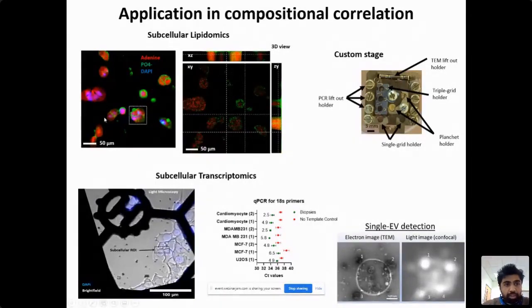So this image here shows how I've used the cryo-confocal setup to identify regions, cellular and subcellular regions of interest. Here in blue, you're looking at DAPI. And then I was able to move this sample into a mass spectrometry instrument. So this is a newly established hybrid SIMS instrument. And basically, you're able to get thousands of chemistries out of it in 3D nanoscale, because this instrument can go to around 50 nanometers in spatial and 2 nanometers in depth resolution.